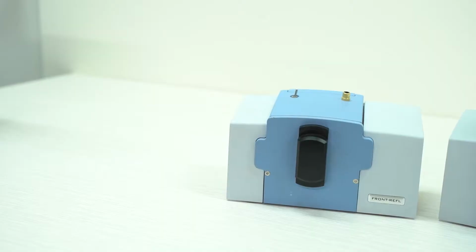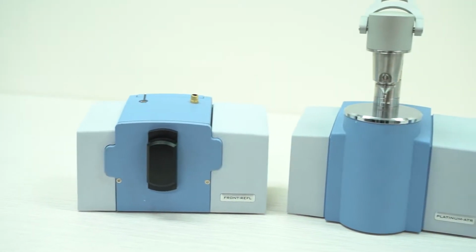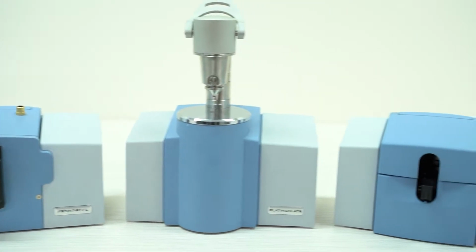So today we're going to look at some of Google's most asked questions about FTIR. Here at Portable Spectral Services we have a benchtop FTIR unit. It is a Bruker Alpha 2. It comes with a range of different attachments, which is fantastic for analysing a range of different sample types, so solids, liquids, gases, that sort of thing. So let's get started.